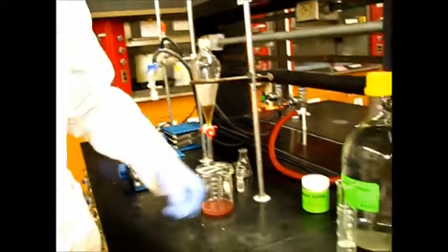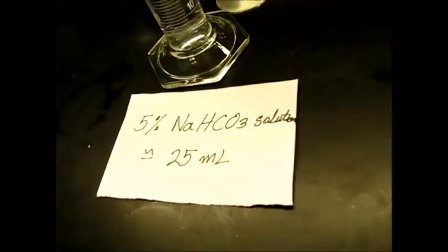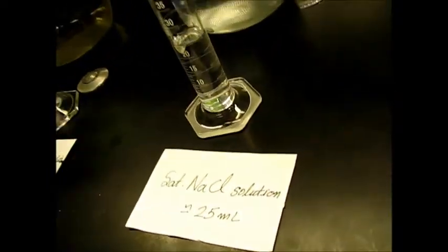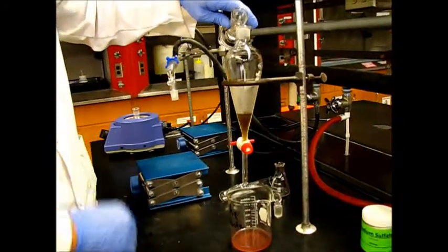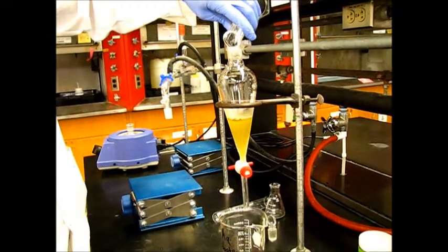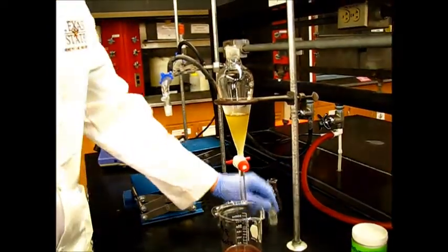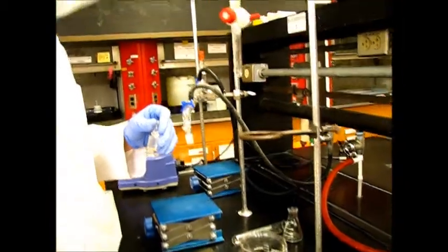Cool. So next we're going to wash with 25 milliliters of 5% sodium bicarbonate. We're going to do this step twice, and then we're going to follow it with 25 milliliters of saturated sodium chloride. We're just going to do that one once. This is to neutralize any remaining acetic acid, so you should see some bubbles similar to our last video with the nitration experiment. It's also important to remember to vent this funnel regularly because there will be some gas buildup.